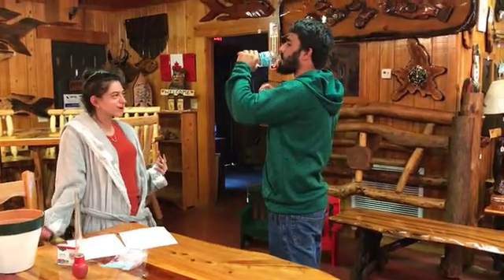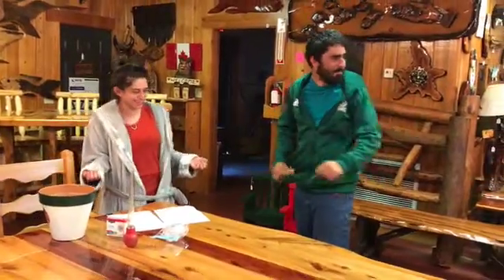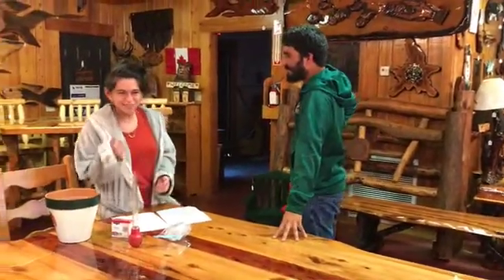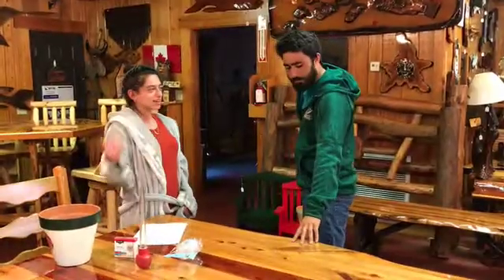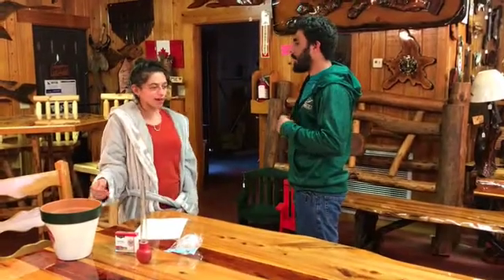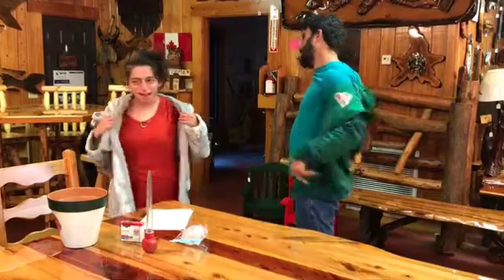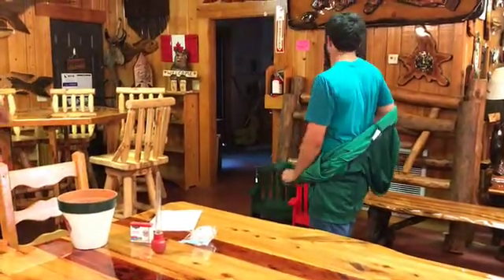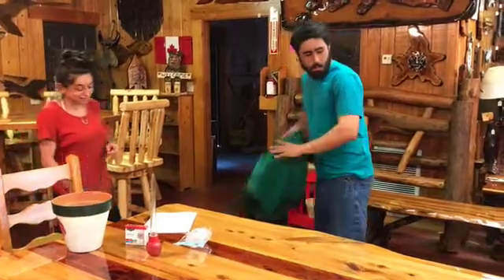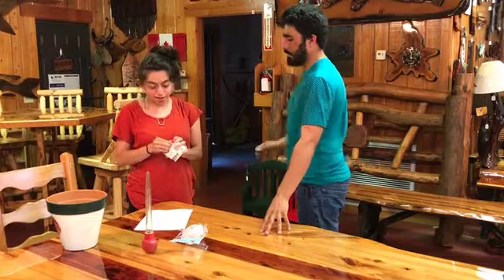Hunter, there's no food or drink in the lab. Put it away. Perfect. We're leaving it. Okay, so the air conditioning seems to be broken, and you have already taken a drink of water. So we're just gonna go ahead and take off our lab coats. And you're not supposed to do that, so just remember that. That's bad lab safety.